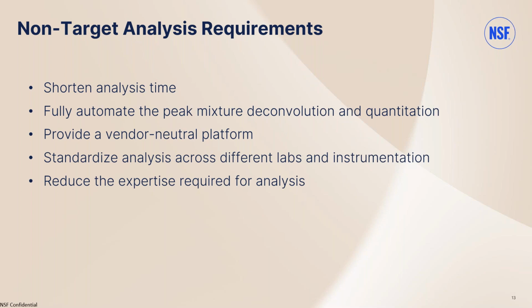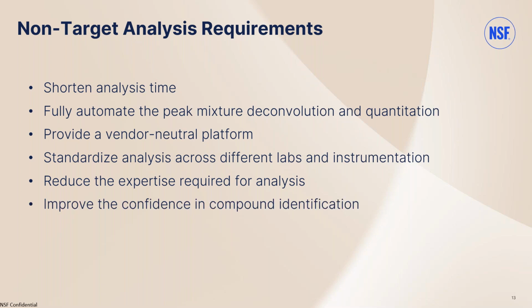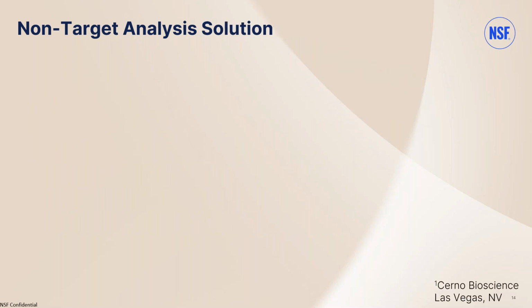And again, we wanted to reduce the expertise required for analysis, which would make more analysts available to do the work. And we had some other hopes that we were also able to realize here. One is that we wanted to improve the confidence in the compound identification beyond what we were able to achieve with just NIST searches. And again, we wanted to integrate with our LIMS system.